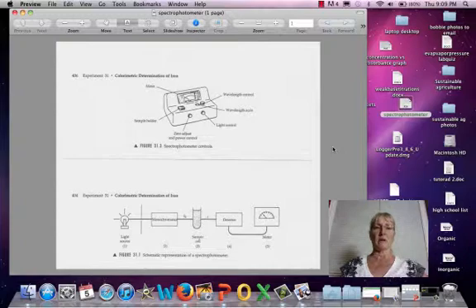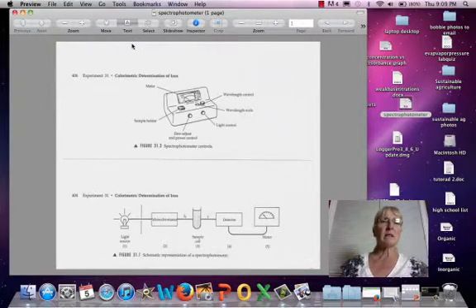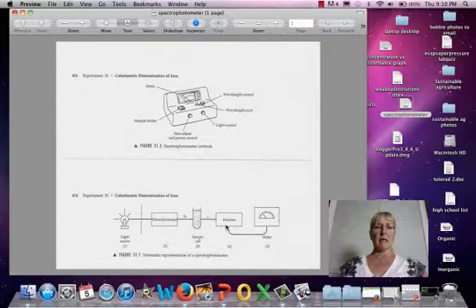But what I'd like to focus on is a schematic of what it looks like actually inside. So maybe let's take a look down at the picture here at the bottom. Whether it's a colorimeter or a spectrophotometer, you have to have a light source. Then the light is transmitted, light of a particular intensity, towards your cuvette. The intensity of the light is detected in this detector and then registers as a particular amount of absorbance that you can see on that dial on the far right. And essentially that's what we did with our colorimeters in this schematic sense.